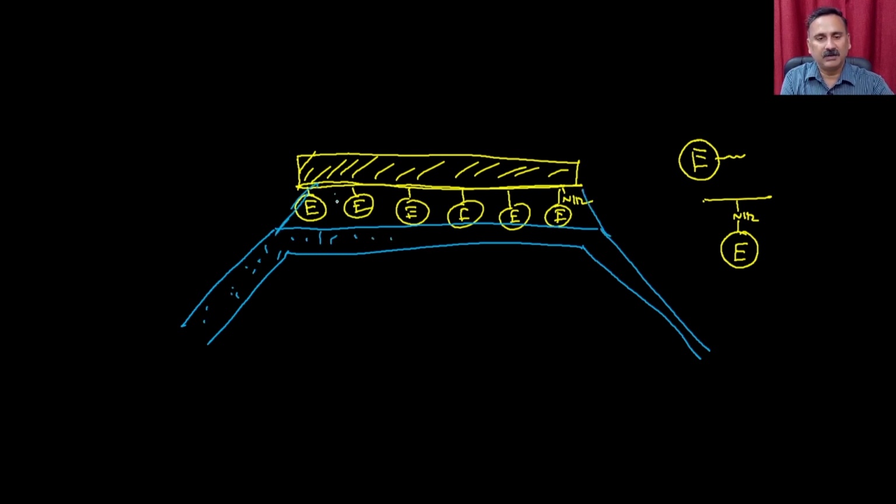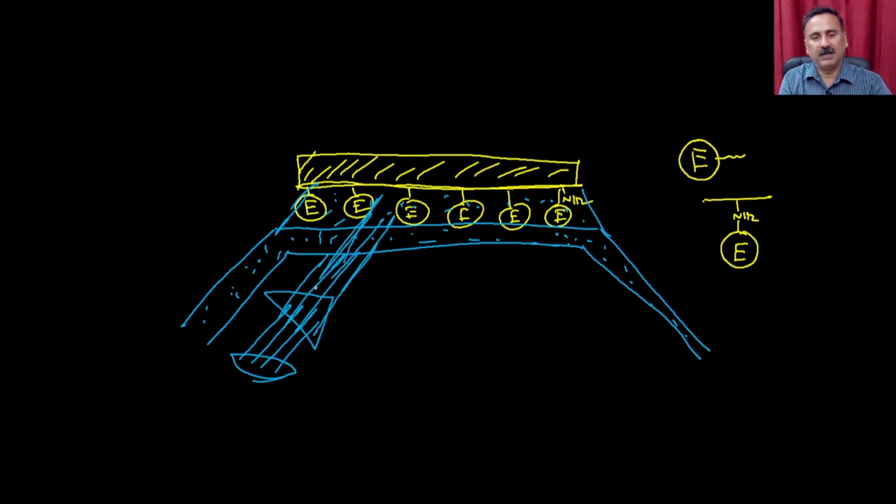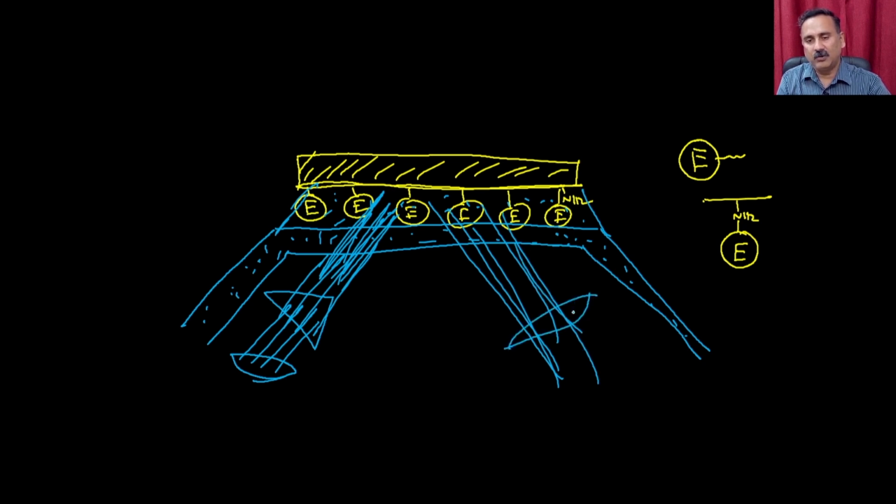It will cover the metal surface also, right? So I can have the metal surface through which I can flow the liquids. And below this I can have the light source. Then we can have the prism so that I can illuminate the sample with this particular wavelength, and I can also collect the wavelengths like this, on this side, and then I can have a detector.